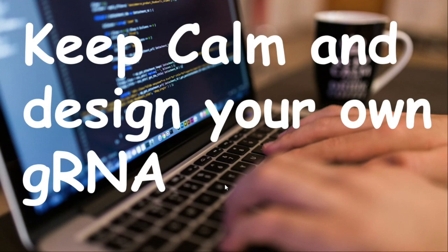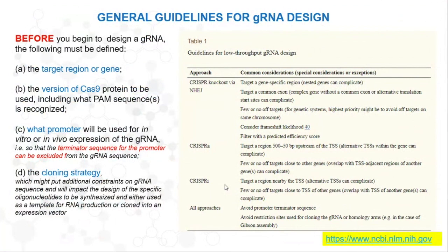So let's start. Before we start, I just want to take you all through some 4-5 general tips or guidelines for designing guide RNAs. First of all, before you begin to design a guide RNA, the following must be defined.